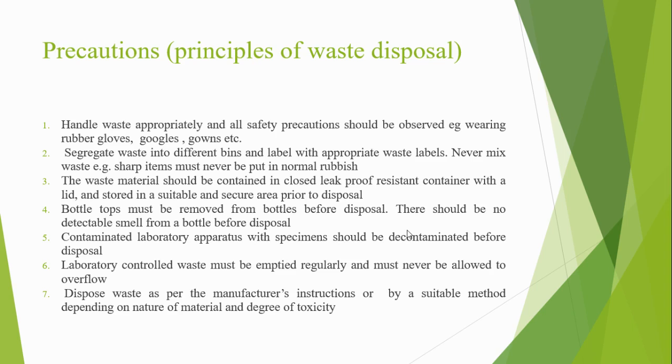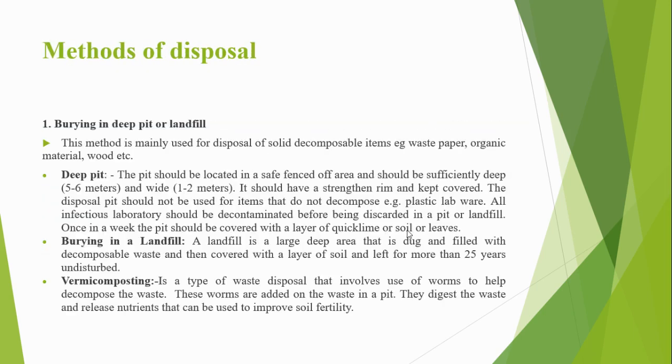Another thing, bottle tops should be removed from bottles before you dispose of waste in bottles. Then lastly, contaminated laboratory apparatus with specimens should be decontaminated before disposal. So that is that. Let us now look at the methods of disposing waste.